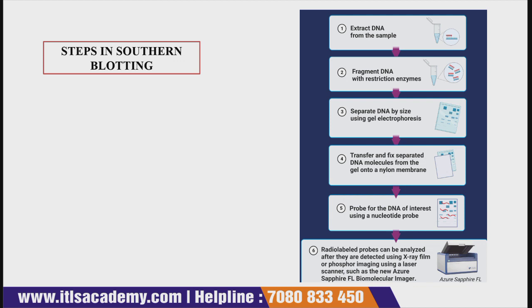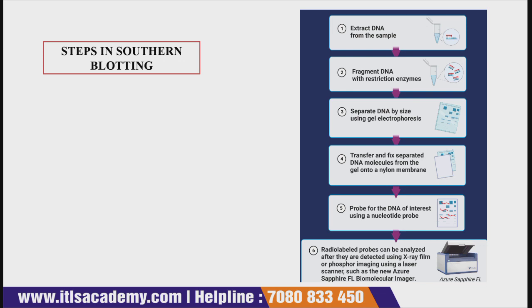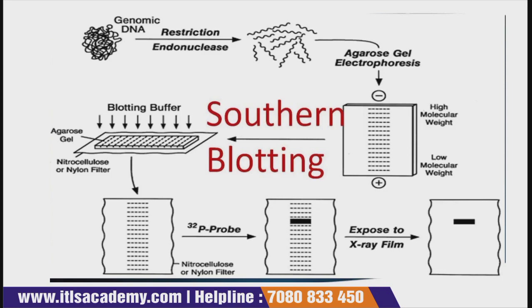And then the radiolabeled probes can be analyzed after they are detected using X-ray film or phosphor imaging using a laser scanner. An example is the Azure Sapphire, the same device that we use for detecting RNA also, and for identification of DNA.